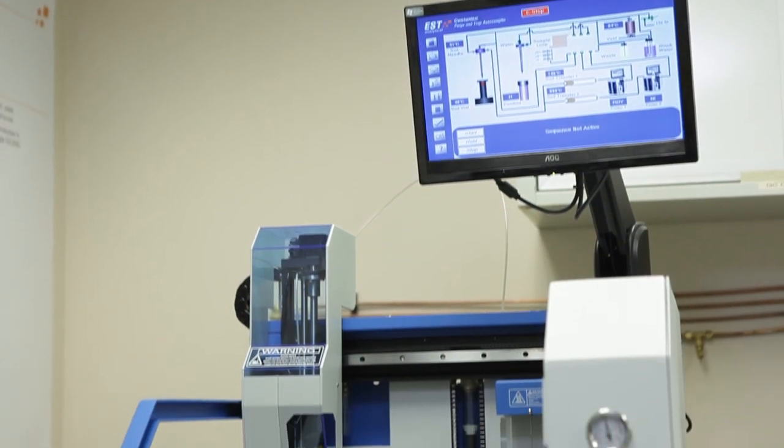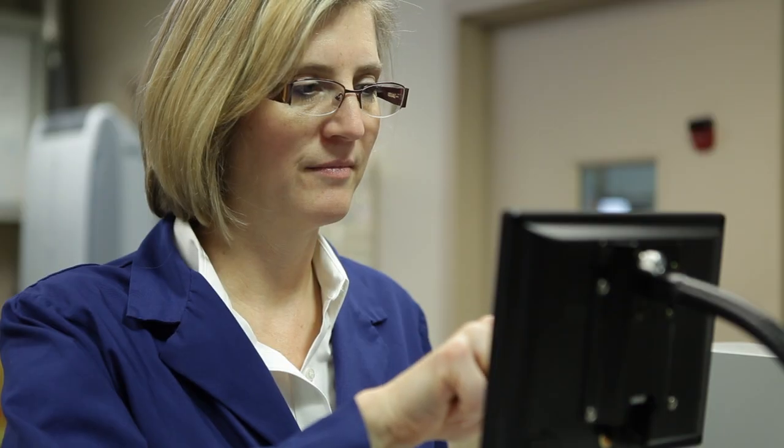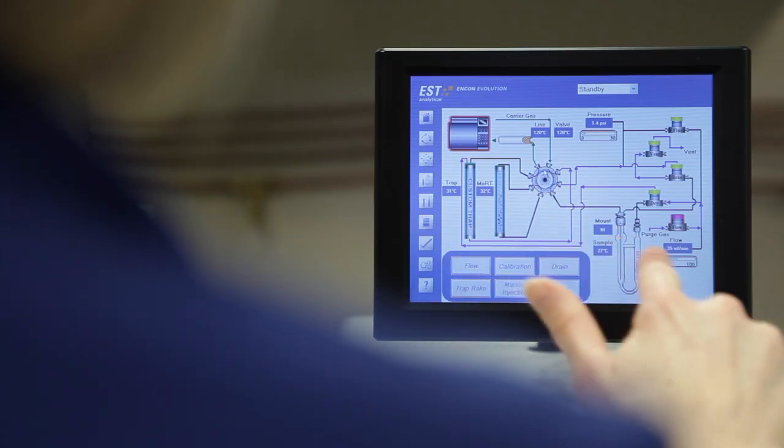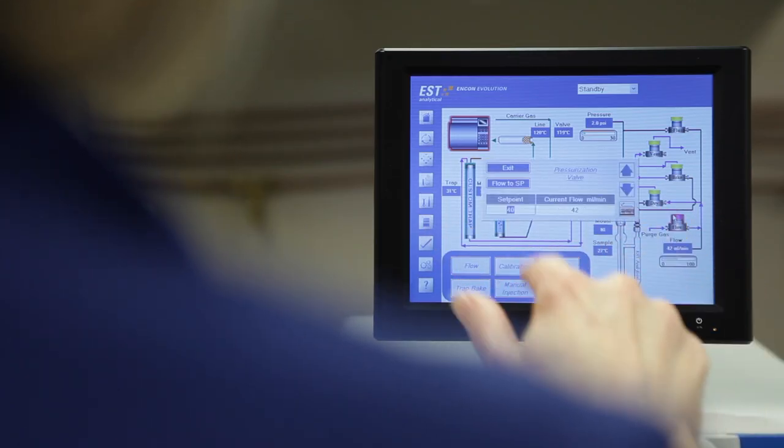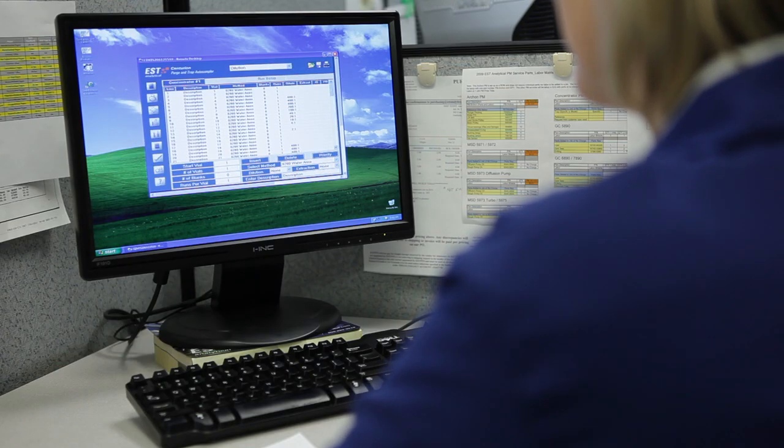We also have a syringe option for dilutions up to 400 to one. The Centurion and ENCON EV both utilize an onboard operating system and graphical interface that can be run from the instrument or from the PC controlling your GC or GCMS.